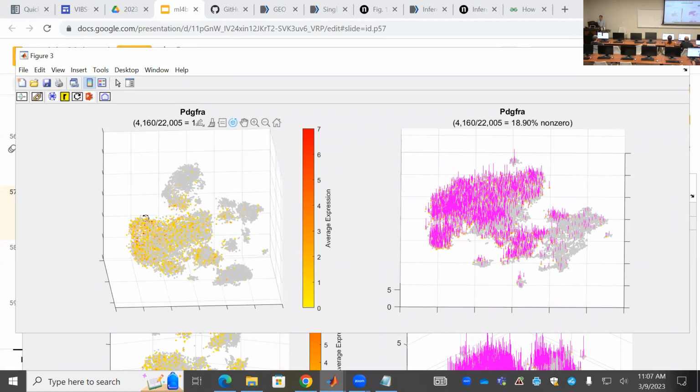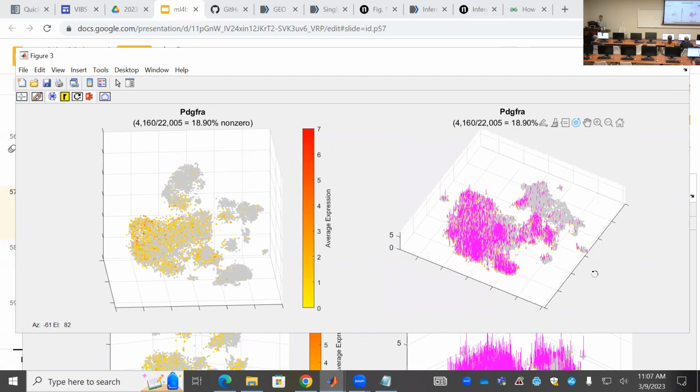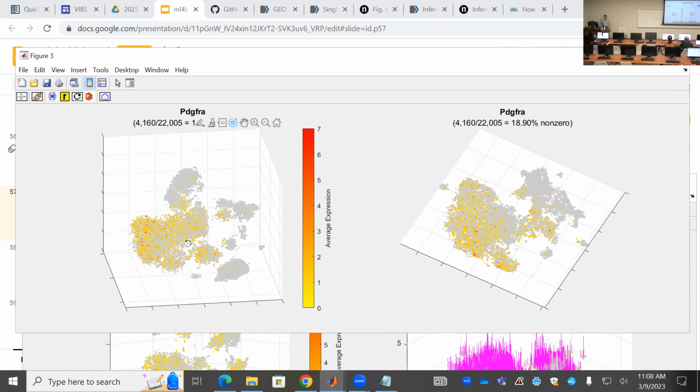Receptor A is highly expressed in the fibroblast. Okay, so we probably can draw that endothelium cell produces ligand and gives to fibroblasts, and the fibroblast uses subunit A to receive the message. While it gave to stellate cell, which uses subunit B more to receive this message. I don't know, but this is like a computer inference to try to help others.